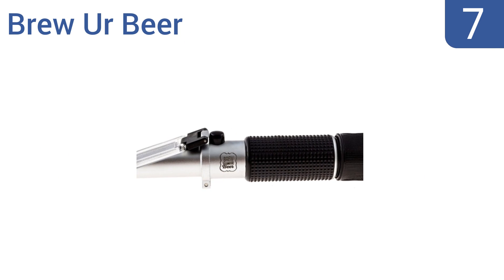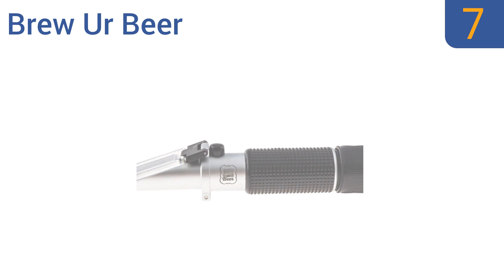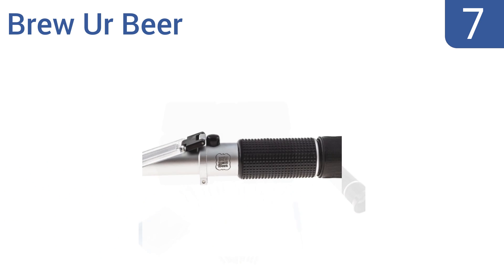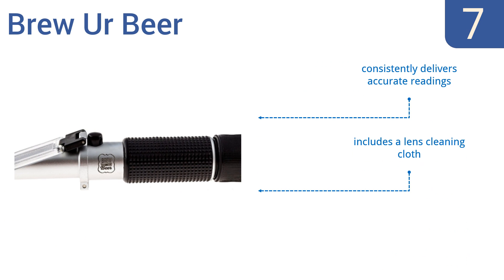At number 7, the ergonomically designed Brew Ur Beer will help you optimize the quality and flavor of your home brew to your satisfaction. If you're ready to step up your brewing process to the next level, it's a smart choice. It consistently delivers accurate readings and comes with a lens cleaning cloth, but it doesn't come with an instruction manual.